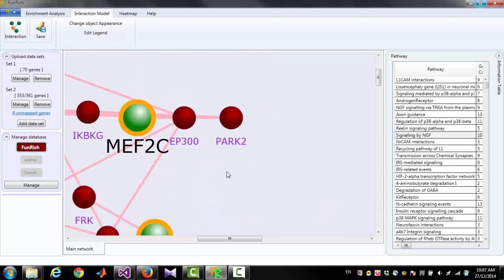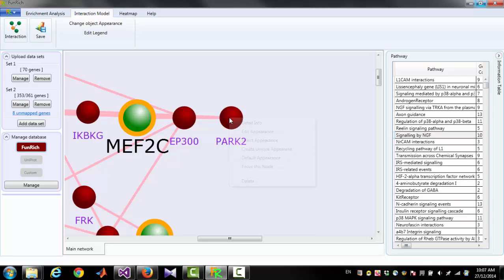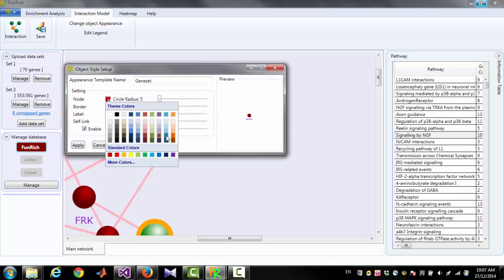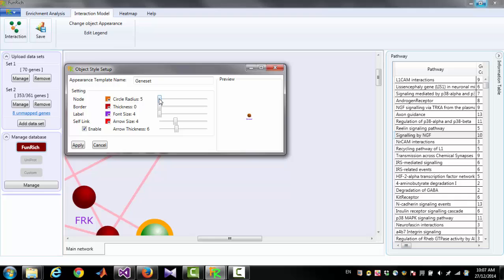To change the color and size of those circles and text labels, you have to right-click on a node and click 'Edit Appearance'. Now you can change the color and size of those circles, their borders, or labels.